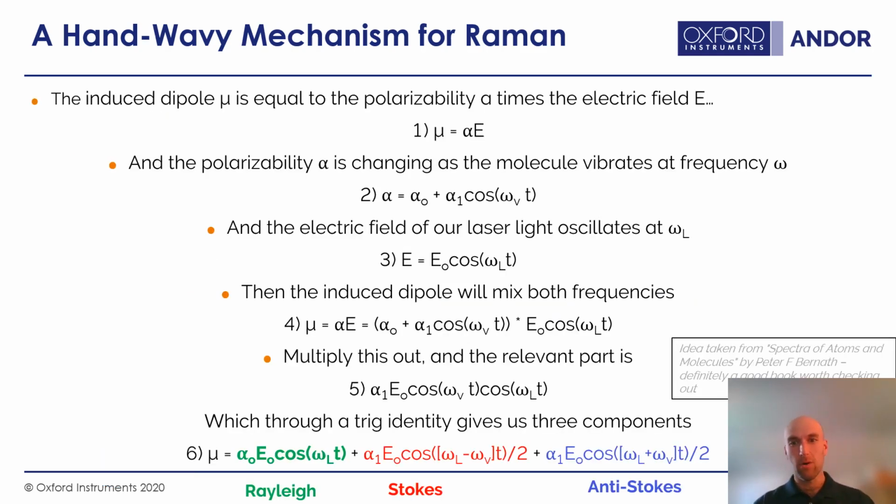So what does it mean now? How do we go back from that to imagine some way where the electric field from light can interact with the vibration of a molecule? The mechanism is that those two things interact through the polarizability of the molecule as it vibrates, the change in polarizability of the molecule as it vibrates. Here's a very brief and classical approach to that idea. And even though these are equations, please just hear me out. It's a clever and succinct way of putting this.